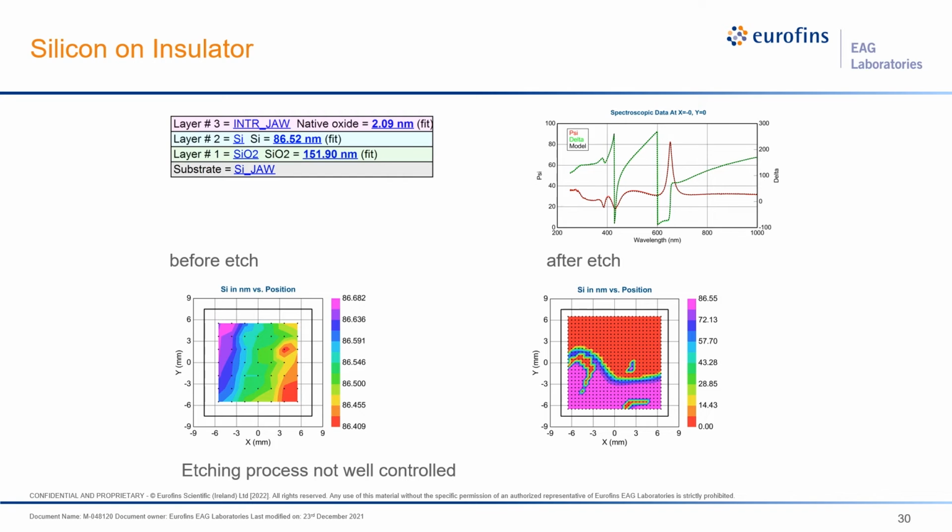It is readily seen that the boundary between the silicon oxide and the remaining silicon is a jagged line instead of a nice straight line as intended. So there was some work to do for the process engineers here.